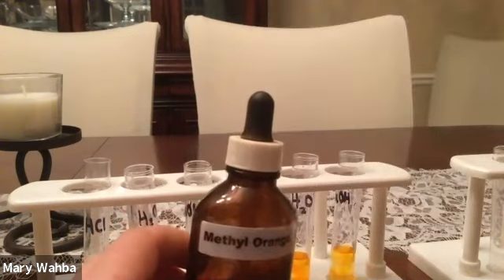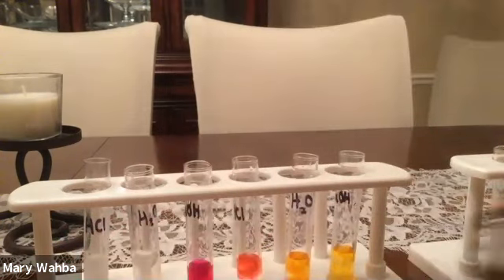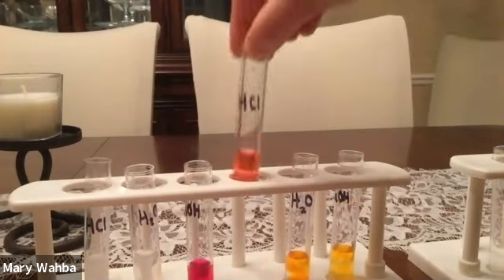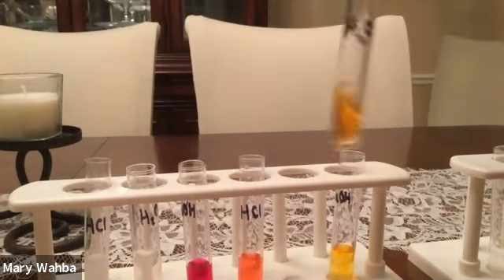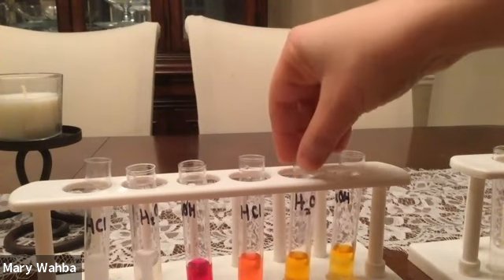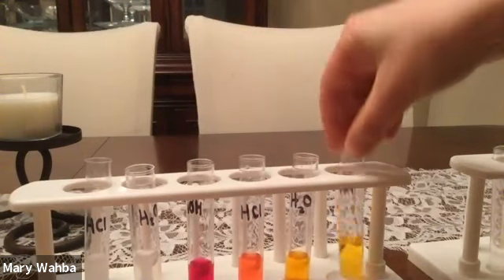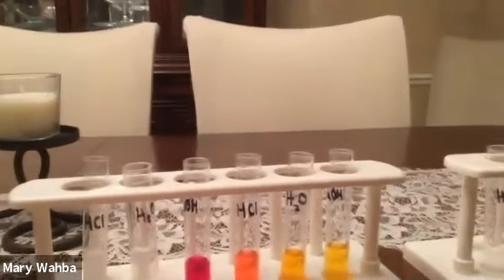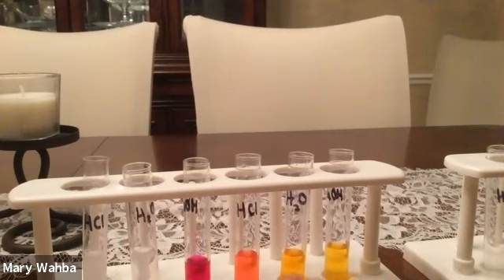Methyl orange, the range of it is orange or red. So you can see in an acid it turns the red color, neutral, it's orange, and in the base it's also orange. And so again, methyl orange only has the ranges of red and orange, and I think it turns around pH 5. So 5 and below, more acidic, would be red, and then 5 and above, so neutral and base, would be an orange color.